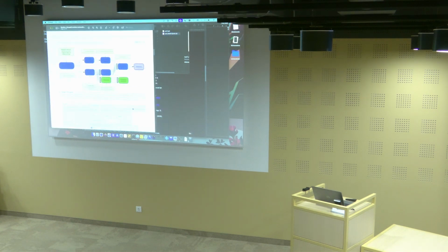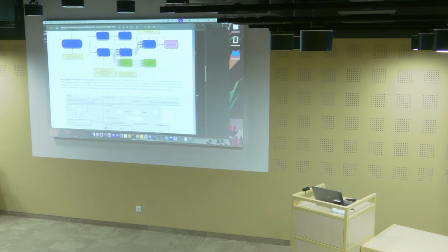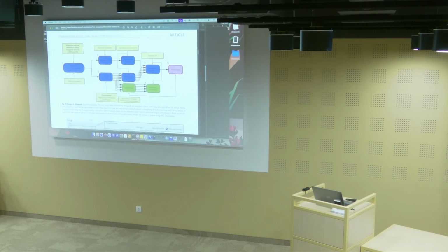In the publication of Xtrapol8, we explain that it comes with some different modes. So we have FO only, fast and furious, and calm and curious. So the main steps in Xtrapol8: the first step is importing the data. It's a bit boring, but essential.